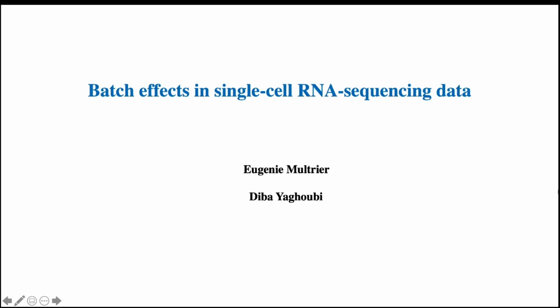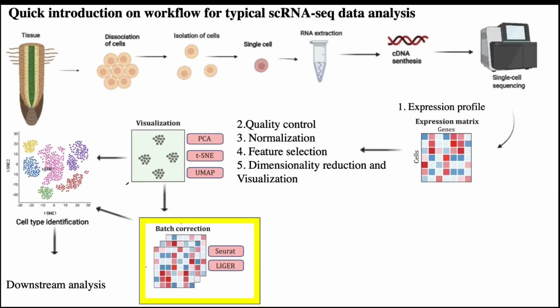Effects in single-cell RNA sequencing data. Here is a quick introduction and workflow for typical single-cell RNA sequencing data analysis, which starts from dissociating target cells from the tissue, cell isolation, RNA extraction, cDNA synthesis, and single-cell sequencing, and achieving the expression profile.